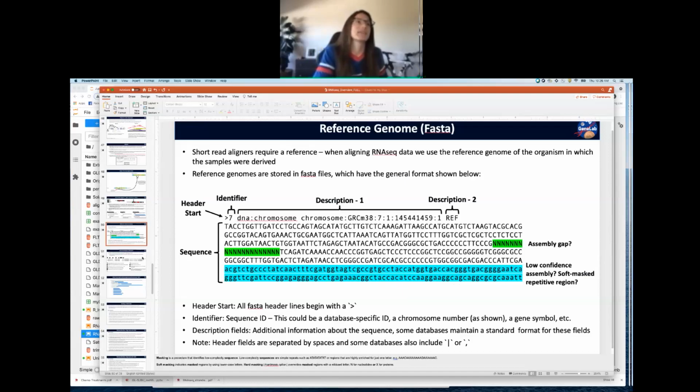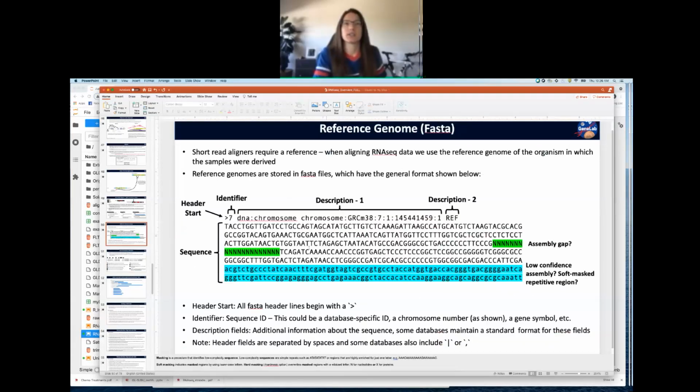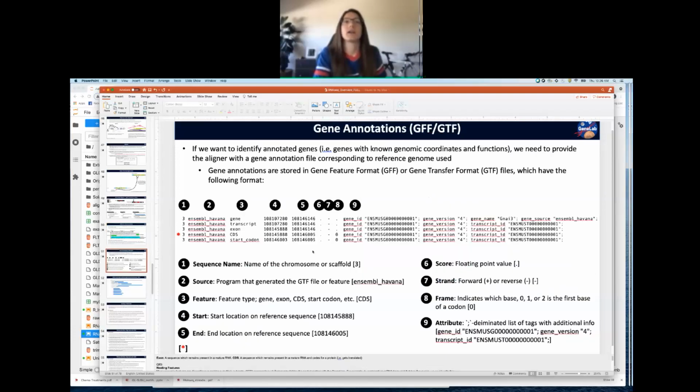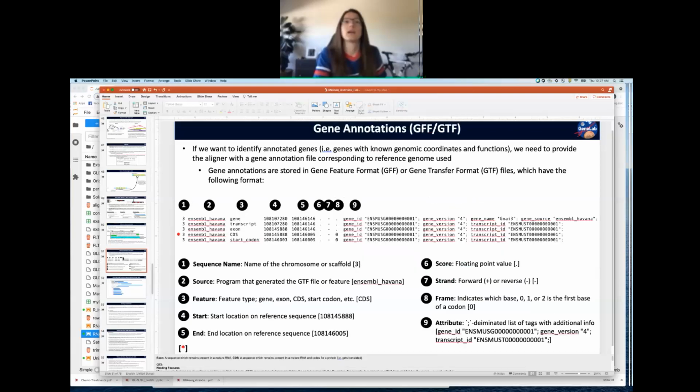not just with the FASTA file, but also looking at the number of locations on that FASTA file that have annotations. So in addition to looking at the FASTA file, you also want to consider how many locations are known and either have a known function or at least know that this region represents a gene or represents a transcript or an exon or an intron. That's what I mean by well annotated. And so the mouse genome is very well annotated. So the build is pretty close to complete. It's over 95% complete. Same with the human. And it's pretty well annotated, so we know what a lot of the locations are on there.